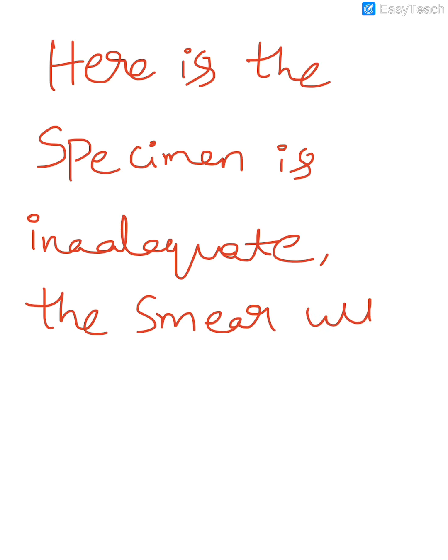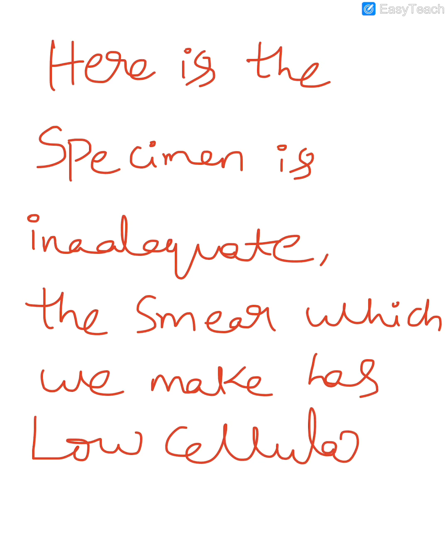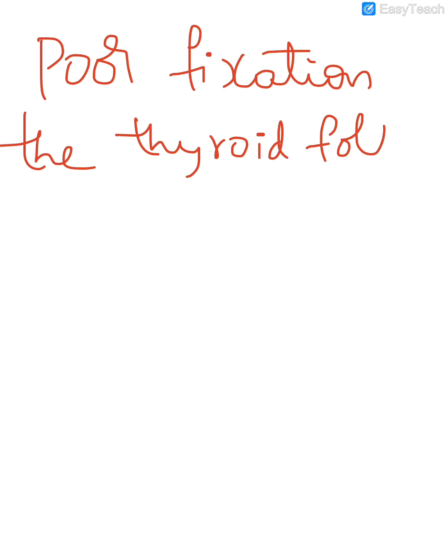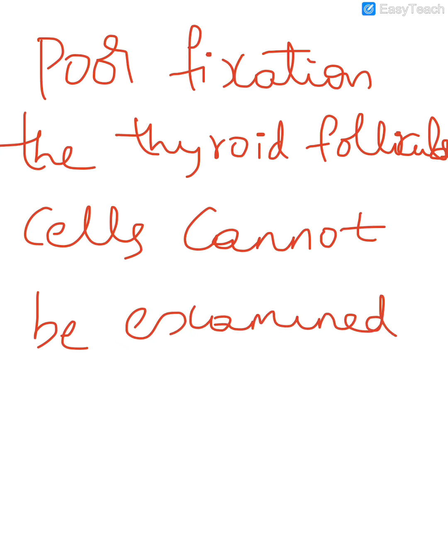The smear which we make has low cellularity, and sometimes because of poor fixation the thyroid follicular cells cannot be examined on the smear.